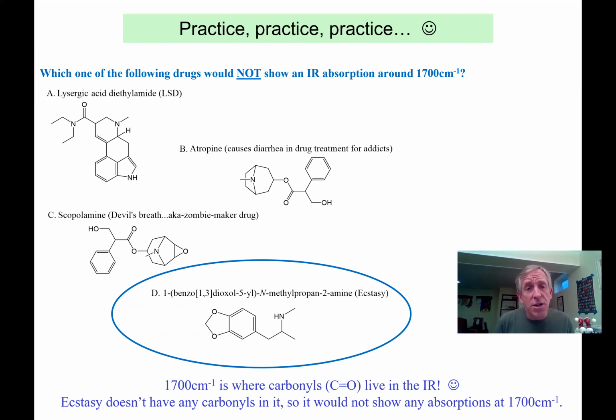It should help you identify what functional groups are on your dual unknowns. So please download your IR spectrum from the resources section of our Google site, and make sure you download the correct unknown IR for your compound. Because if you have the wrong IR for the wrong compound, life is going to get very, very bad for you.